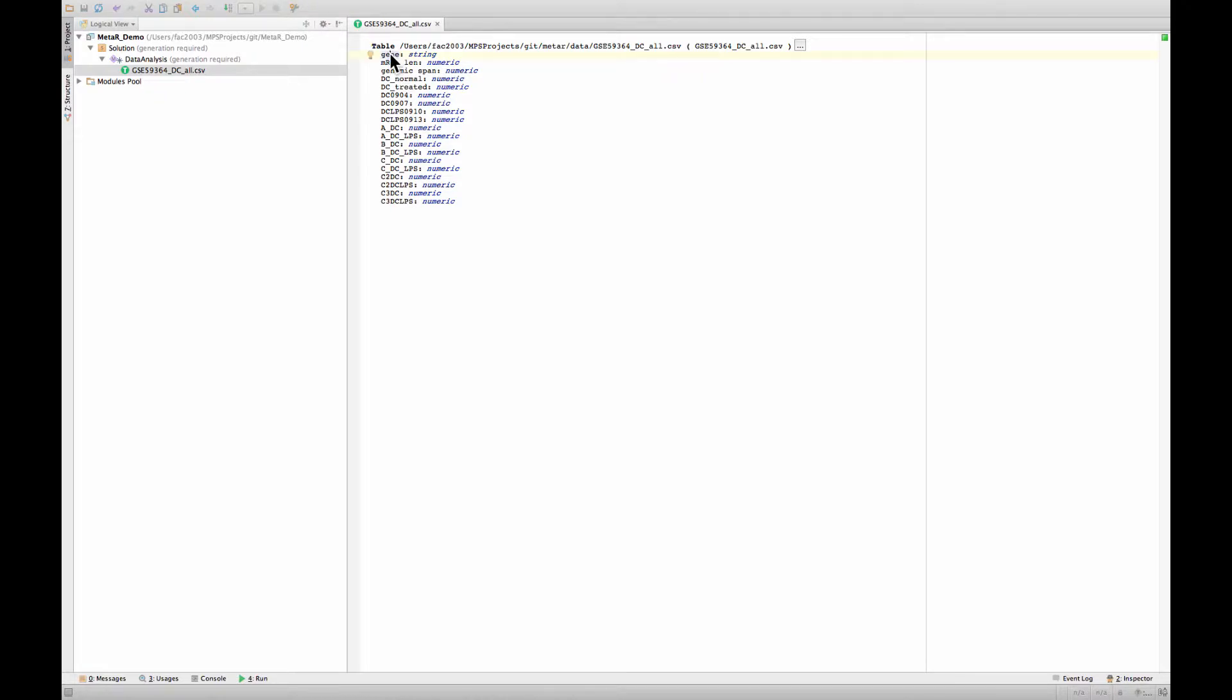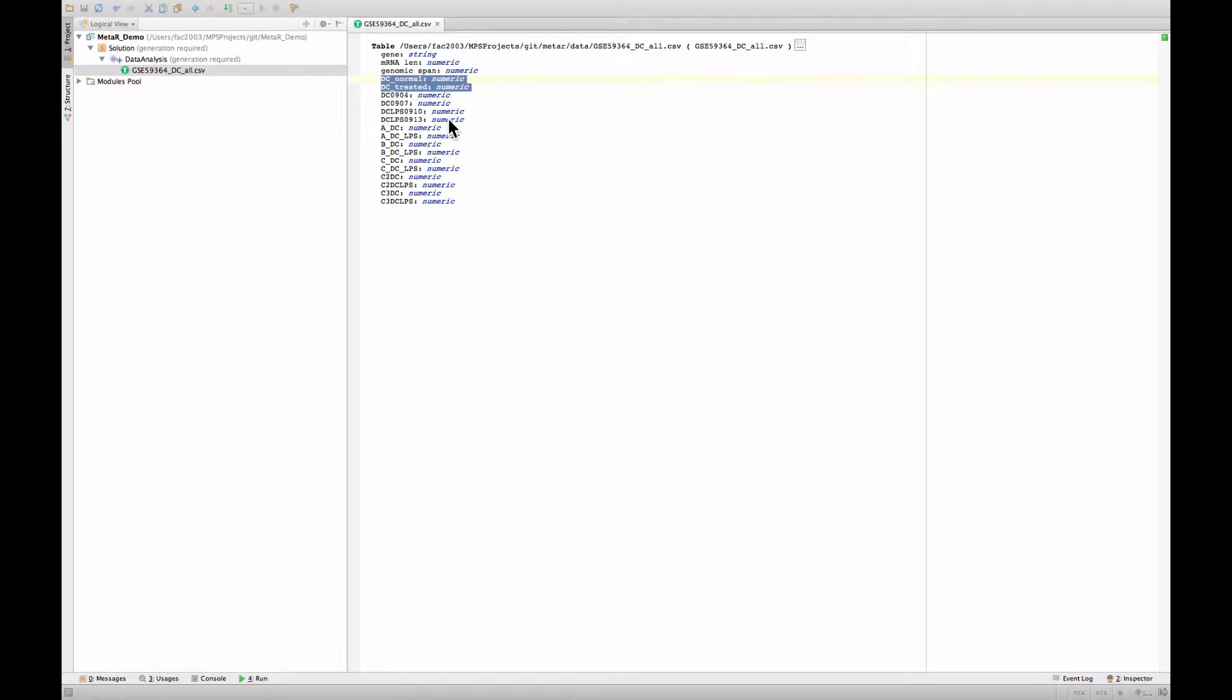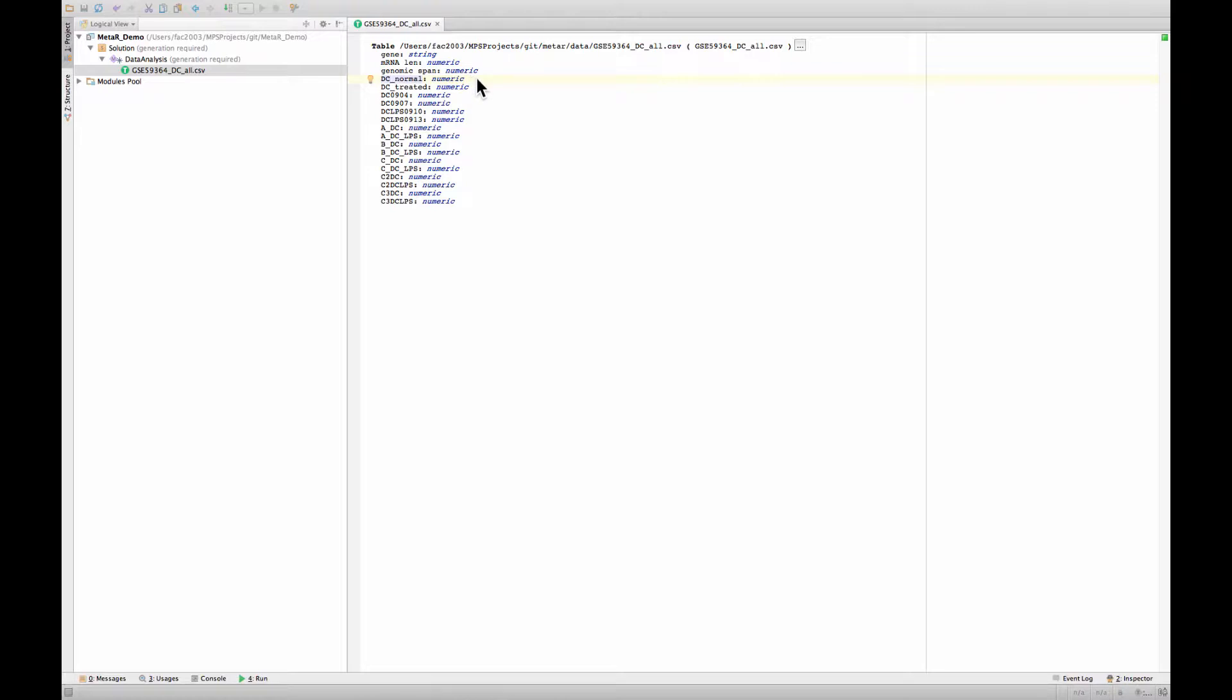You see that the file has a gene column that's of type string, mRNA length, numeric type, and so on. Some of those columns here, those two are actually DC normal and DC treated. So those are group columns, they're averages across groups. We will not need them in this analysis.